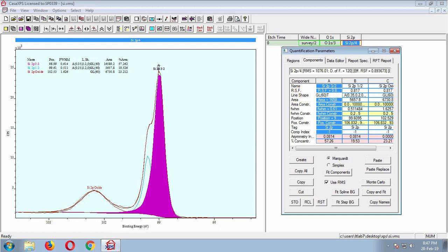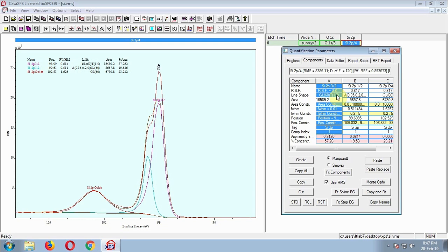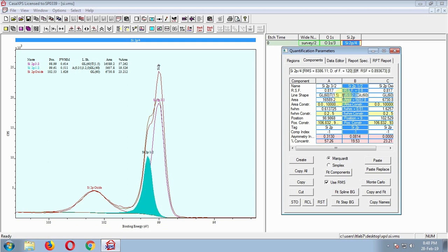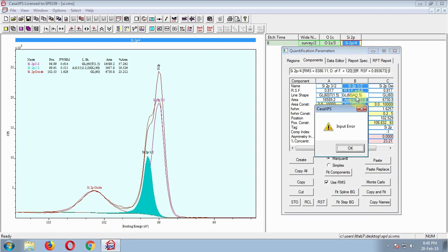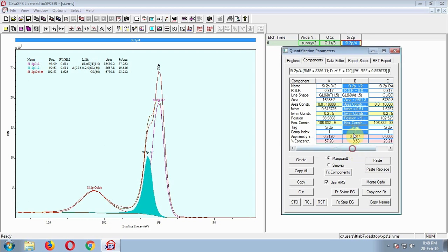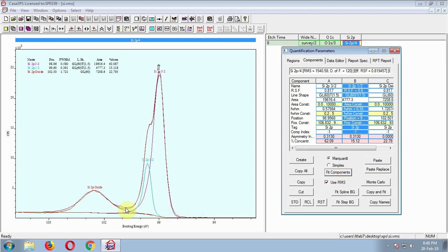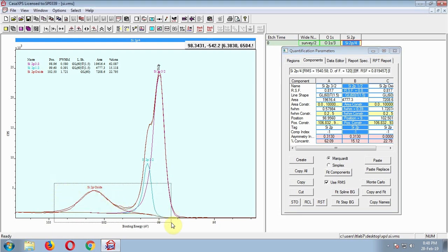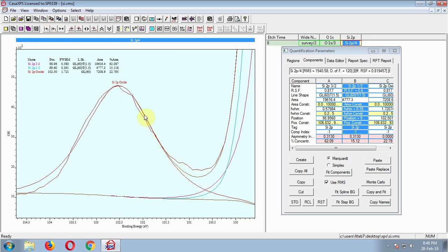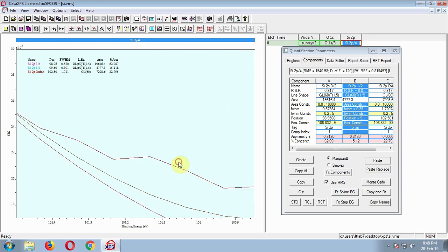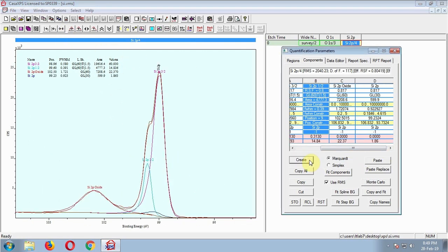What if it is more of an exponential blend than the normal asymmetry function we have used? We can check it. Remove asymmetry and add exponential blend — we can try with T1.5. Now both the 2P3/2 and 2P1/2 look fine. But the oxide peak is not so. Probably there is one more peak here.